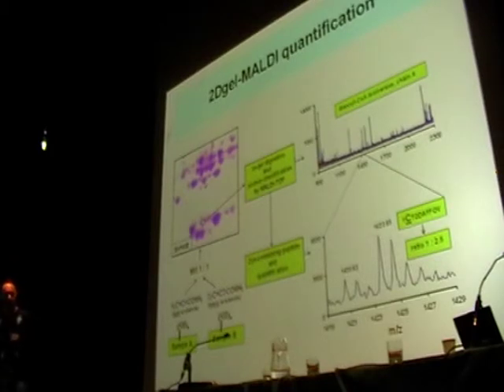Then we come to a point where we have to, at some moment, generate peptides, and separate either proteins at the protein level and then generate peptides, or best to generate peptides and separate peptides. It doesn't matter. There are quite a lot of options for how to do it. I show you just one workflow.